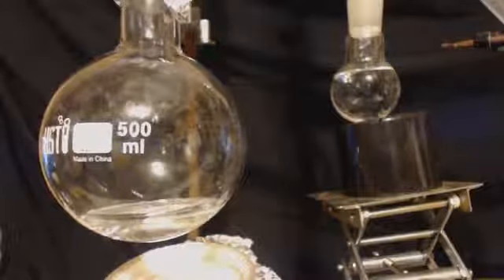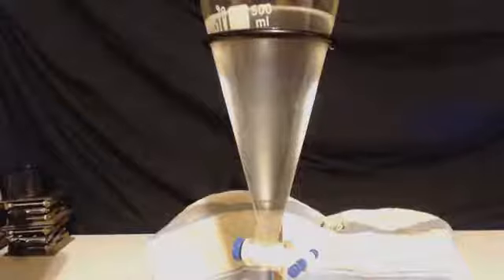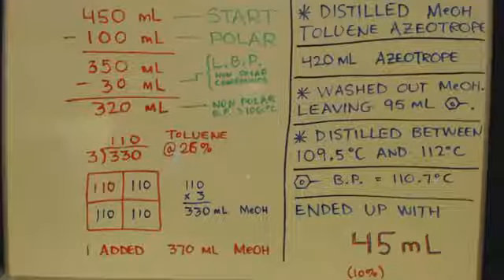And so that's 10%. The MSDS said 20 to 30%. We got 10%, so it's not bad. I did a little summary here. I don't have enough time to read it all, but if you want to press pause and check it out to see how I figured things out, you can. I ended up with 45 milliliters of toluene. That's 10% out of the original 450 I started with.